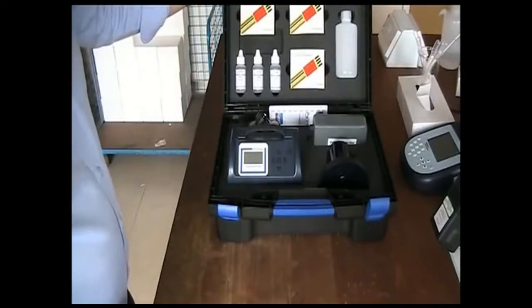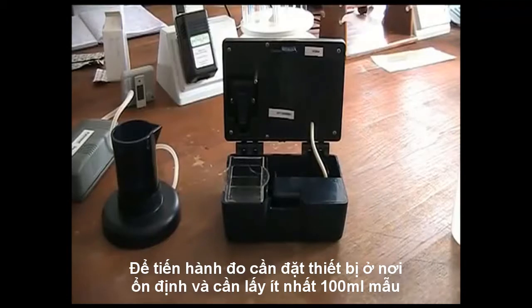To carry out a test, place your equipment on a stable surface and take a sample. You will require at least 100ml of sample to carry out the full test protocol.